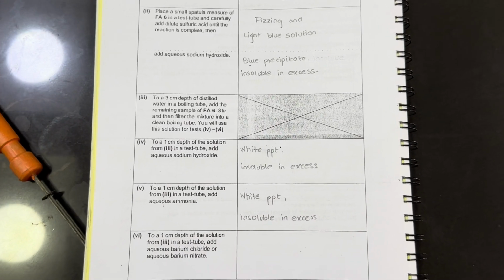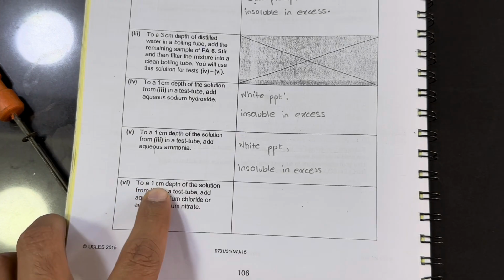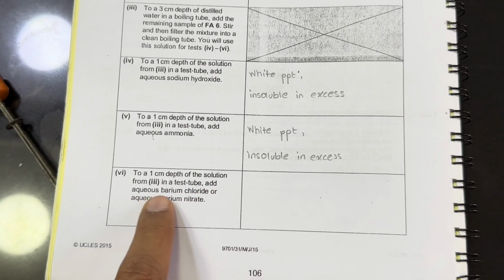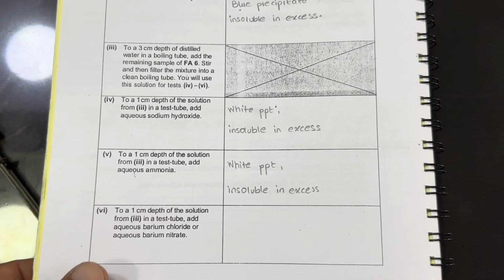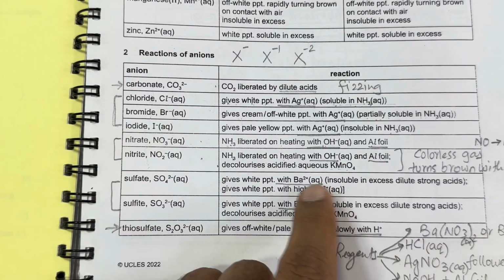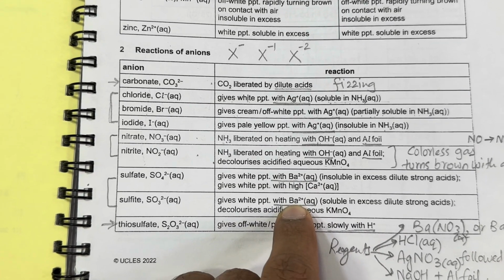Now we will proceed with the next test to the 1 centimeter depth of the solution from part 3 which we have made here. We will again take 1 centimeter depth of that, and then we will add aqueous barium chloride or barium nitrate. Now this barium chloride or barium nitrate is added in order to identify the anion, which is here sulfate or sulfite ions, normally detected by adding any salt of barium, that could be a chloride salt or nitrate salt.